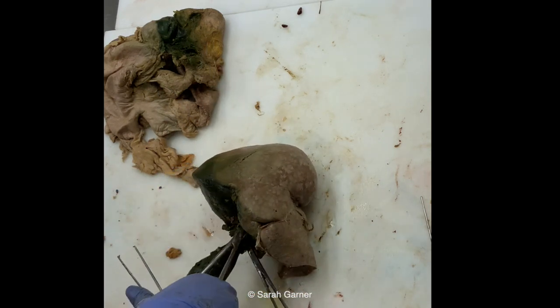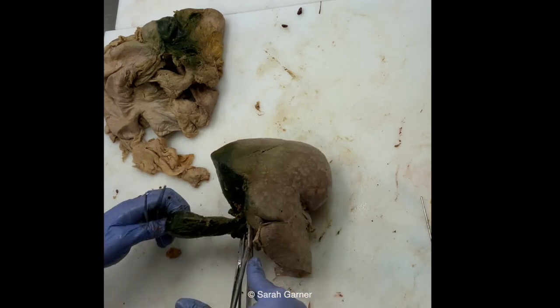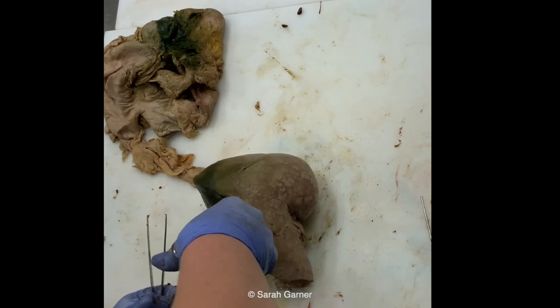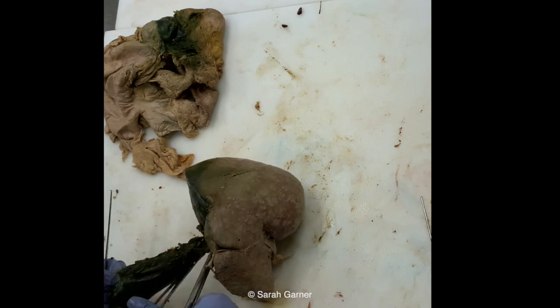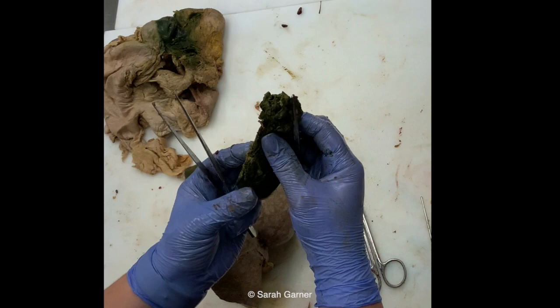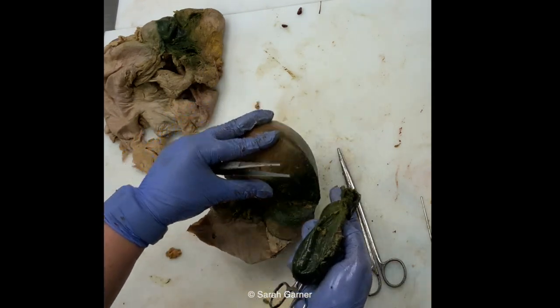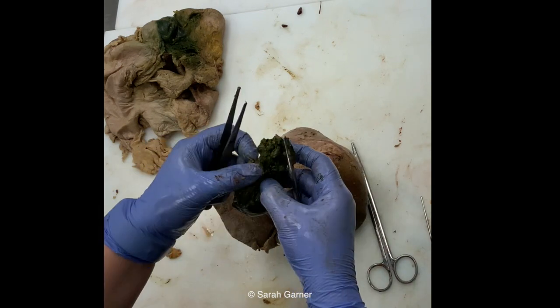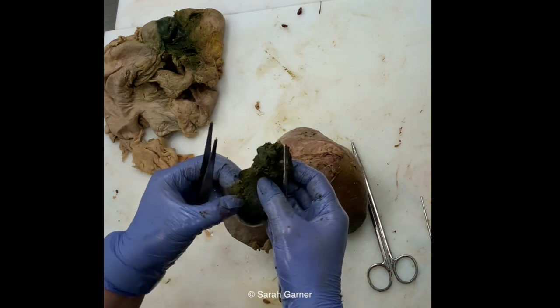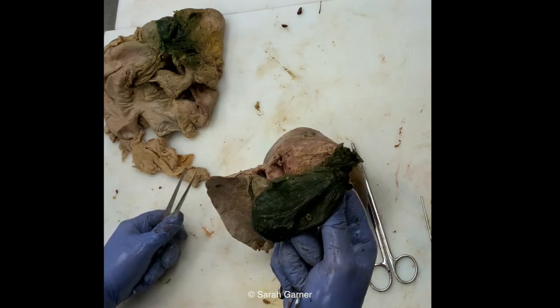So you want to basically just reflect it off the bed and then you will have it separated. So there's your gallbladder. This surface that I had to physically cut off here, that's adventitial surface. So if you get a gallbladder surgical specimen, let's say for cancer, that would be an important margin and an important place to ink. So with this, you'll take it off and ideally you get it off intact like this.